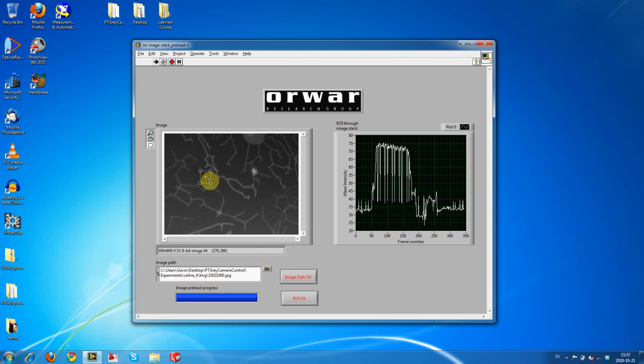So as I move this, and I'll show you in the back end, it runs the little light bulb ROI intensity analysis VI about 350 times for every run of this cycle, and this is running 20 frames per second. So in 1/20th of a second, it reads through 350 files and then figures out what this mean intensity value is. So it's running quite fast.